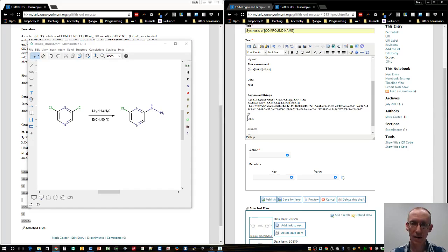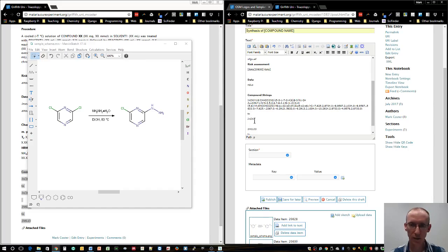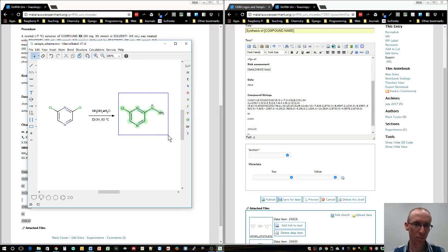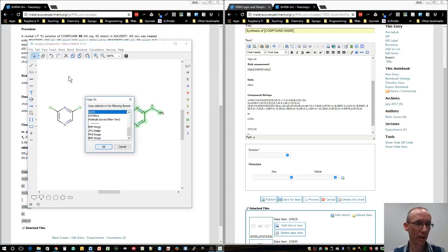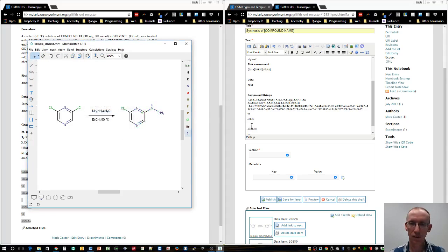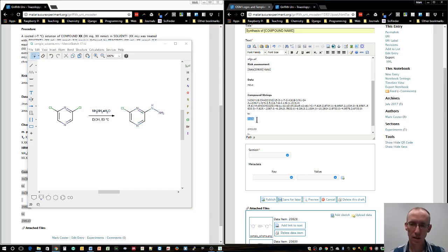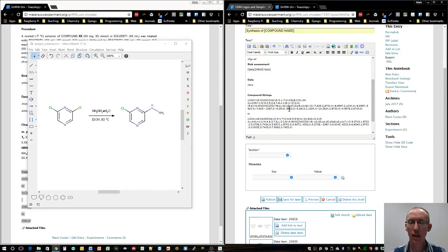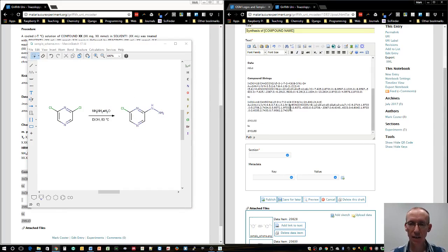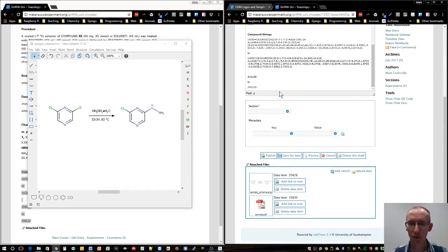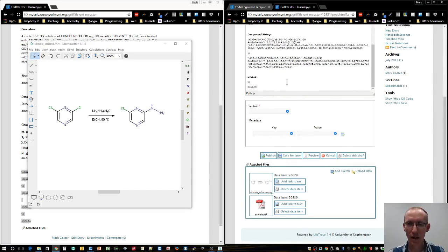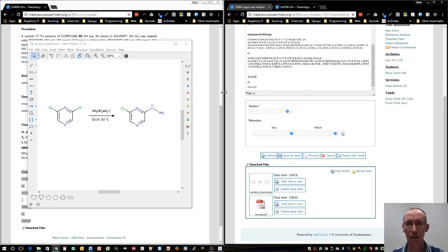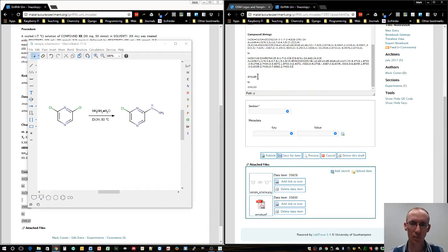Then we want to have that going to a different molecule. We'll select this other molecule here and say edit, copy as, INCHI, and paste again. For reasons I won't go into now, it's beneficial to have more than one way of saying what the molecules are. So we'll also use a SMILES code.